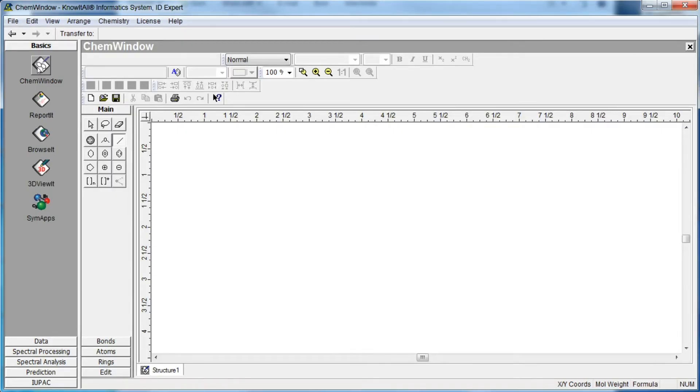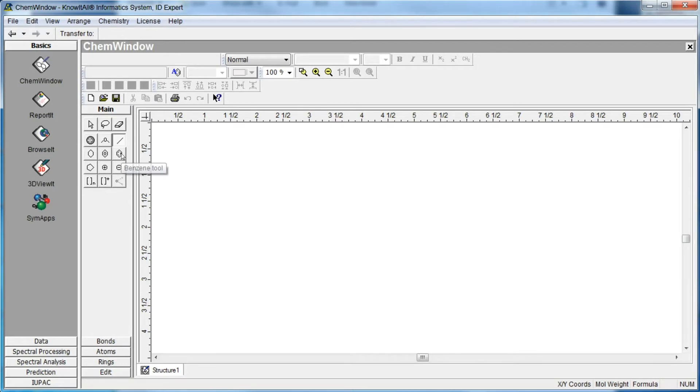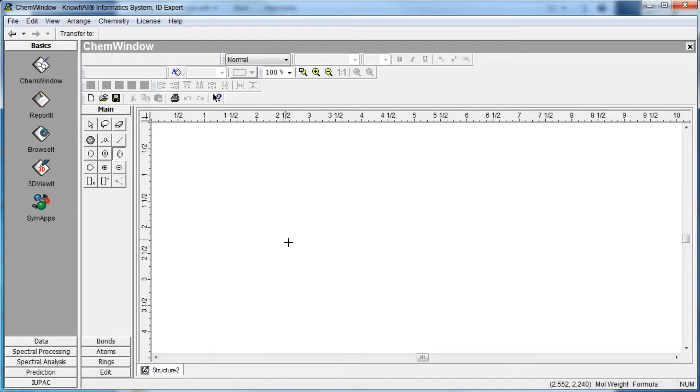We begin by selecting the benzene ring tool in the main section of the chemistry toolbar. Once the tool is selected, move the cursor into the drawing area, then click to draw a benzene ring.